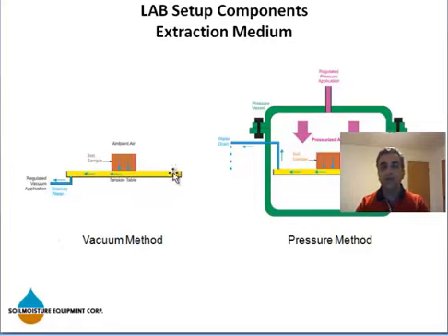But have you ever thought about why air doesn't get into your tension table? In other words, if I apply vacuum to the vacuum port, why doesn't air get into your plate, and why doesn't air get into the drainage port? That is really interesting if you think about it. But that is the property of the tension table or ceramic plate. In other words, water can go through it, but air cannot. And that is the whole reason the system works.